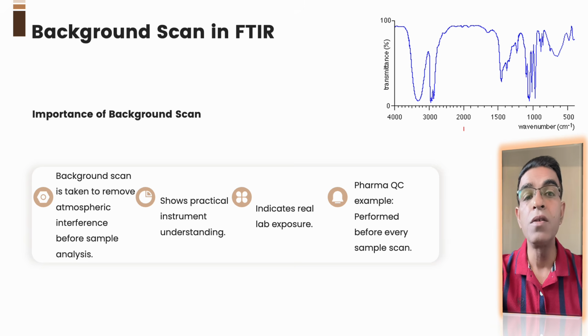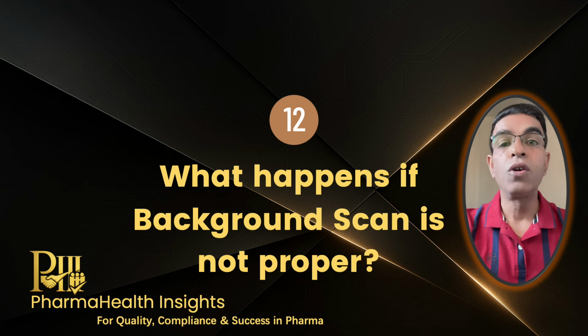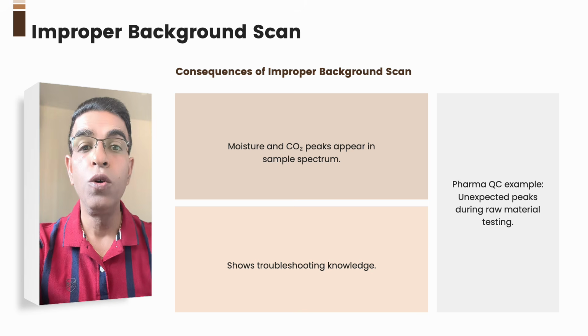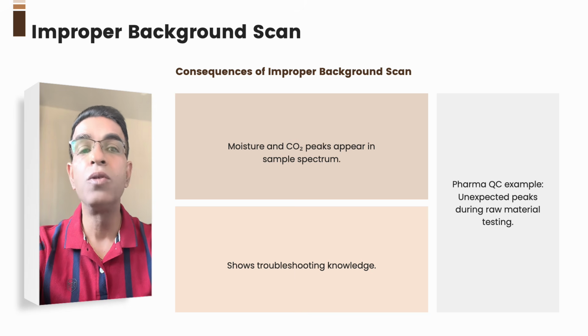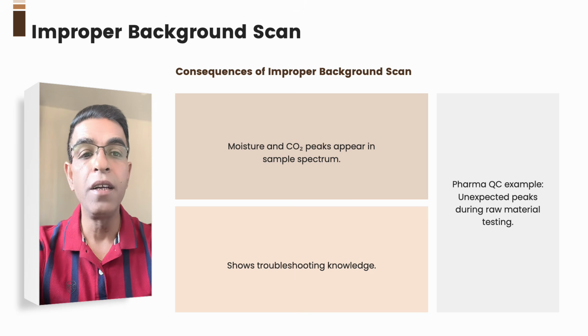This answer works very well because it shows you understand the actual working procedure, not just theoretical concepts. In pharmaceutical QC labs, background check is always done before taking any sample analysis. Your confident answer on the background scanning will now make the interviewer more curious. So, you may expect a follow-up question. What happens if the background scan is not proper? And you should answer in a very practical way.